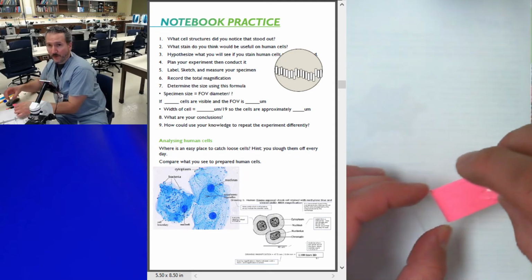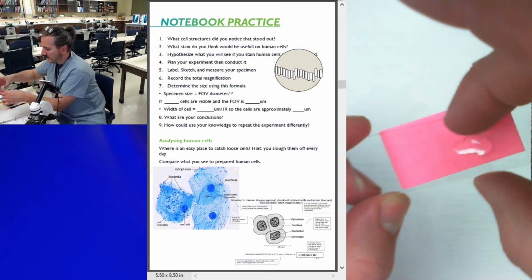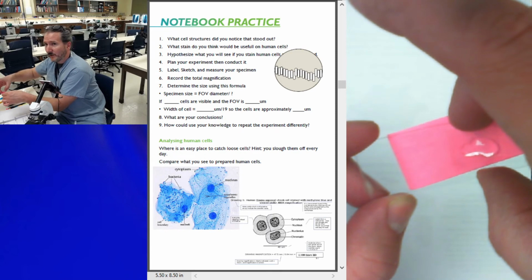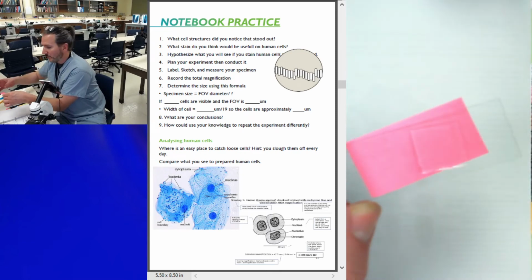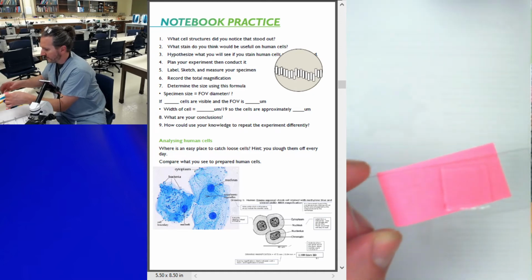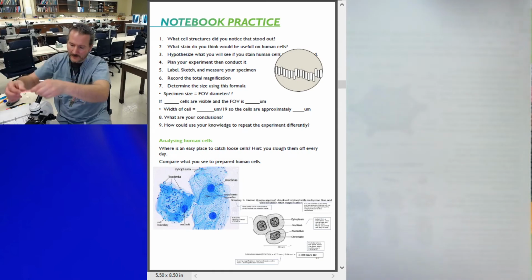Okay. Bring it down to 45 degrees. I know it's hard to see. Dragging it over until I hit that water puddle. Dropping it. Ooh, perfect. All the bubbles are out. Doesn't look like there's any excess. Okay. I'm going to experiment.